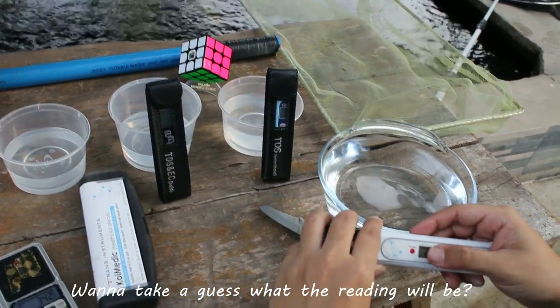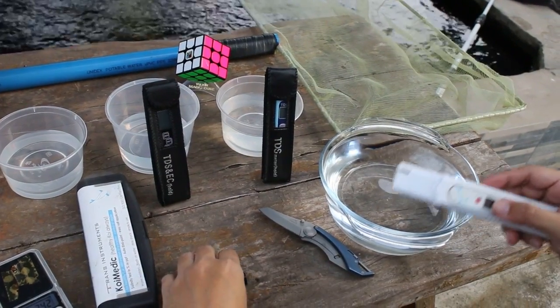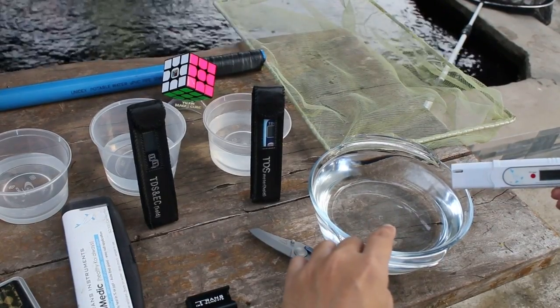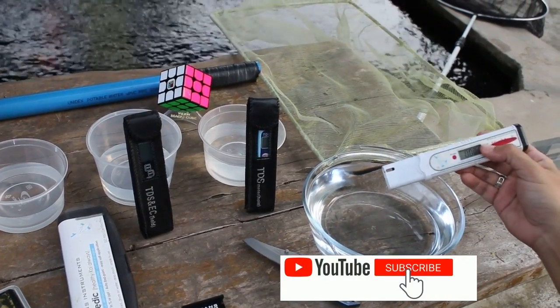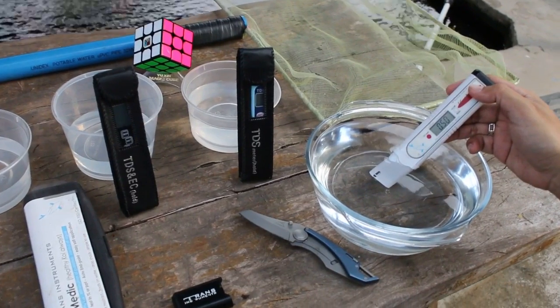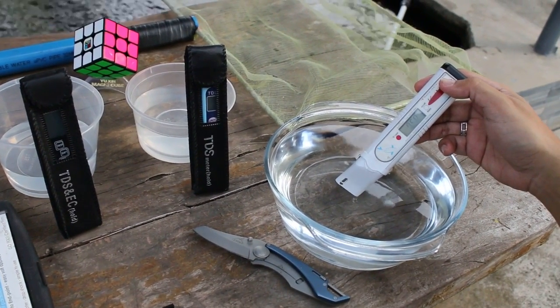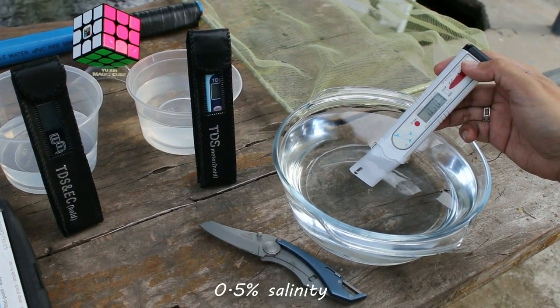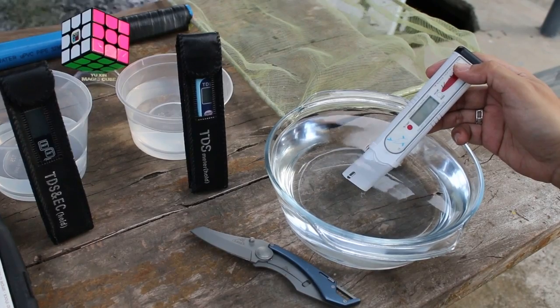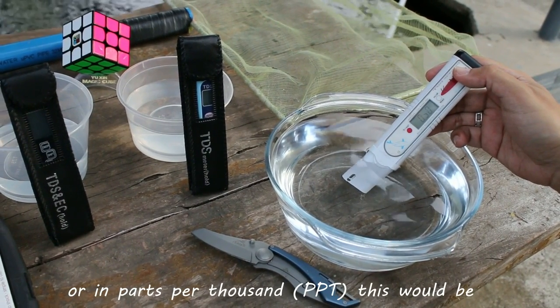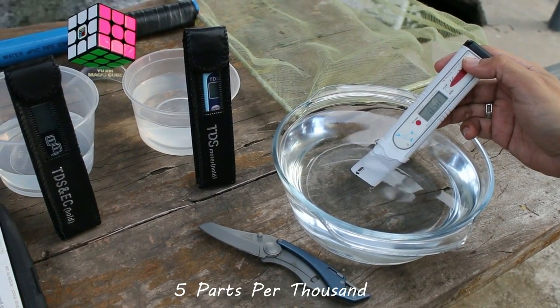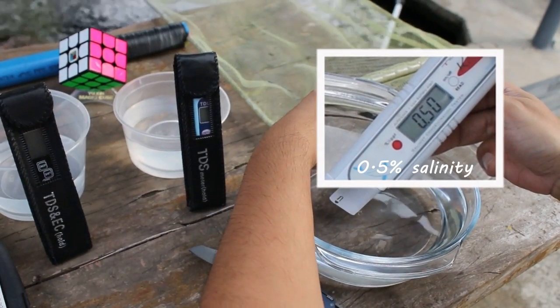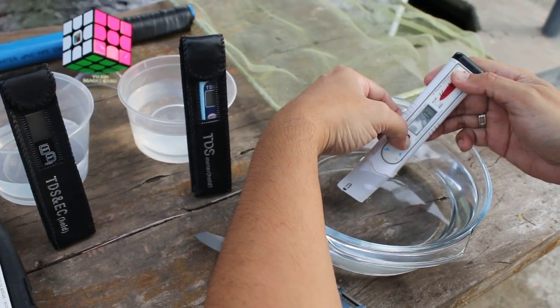Want to take a guess what the reading will be for five grams of salt mixed into one liter of water? Want to guess the reading? Anyhow, here's the reveal. 0.5% salinity, or in parts per thousand this would be five parts per thousand. Let me convert it to you in parts per thousand, hold on, I'm just going to press this. There, 5.0 parts per thousand.